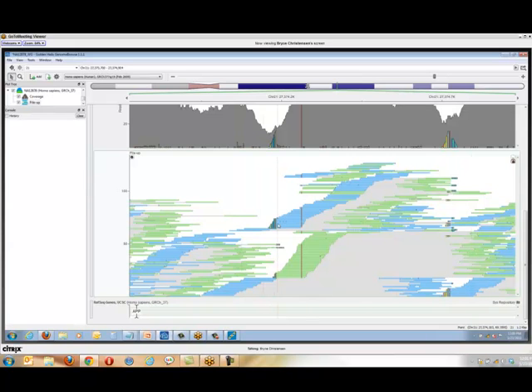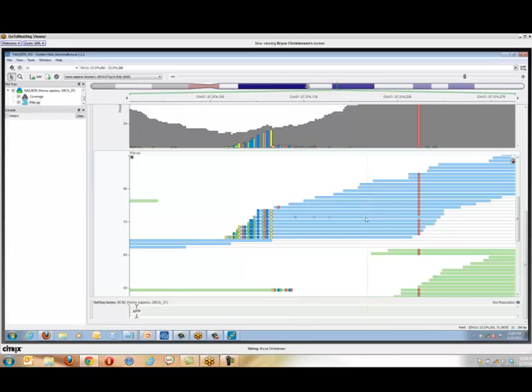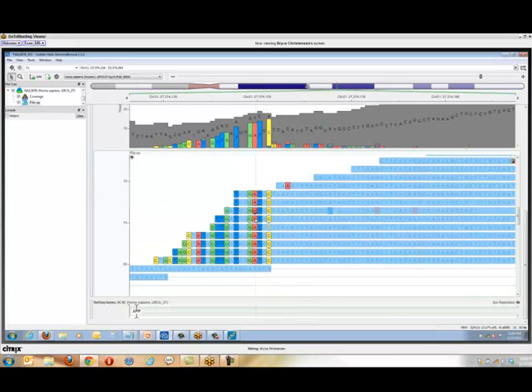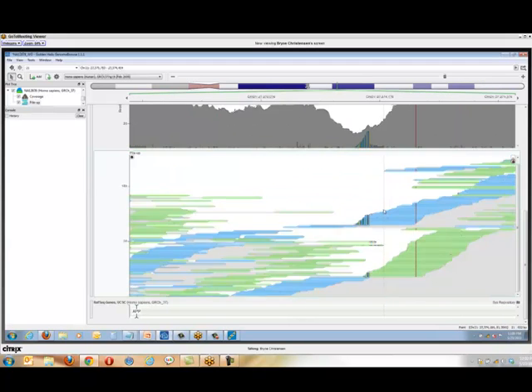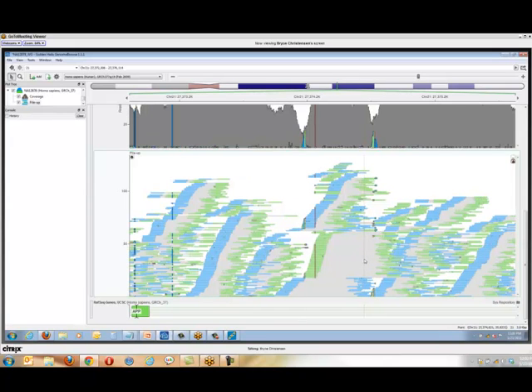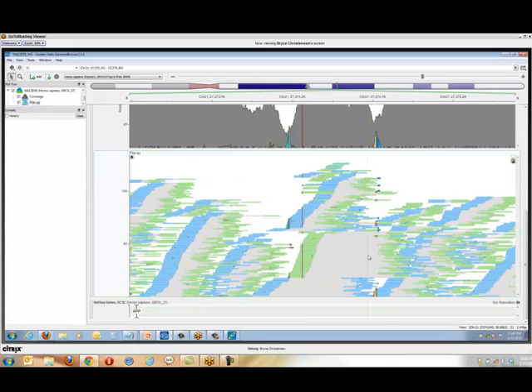And all of these mismatch alleles that we see are at the end of a read where it hits that breakpoint. And if we flipped it over, we would see that this particular sequence of going CC, TAG, CG, whatever, matches exactly what's on the other side of the breakpoint. It's just reversed. And so this is an example of what you would expect to see with a structural variant, in particular with this small inversion. With larger features, it might look a little bit different.